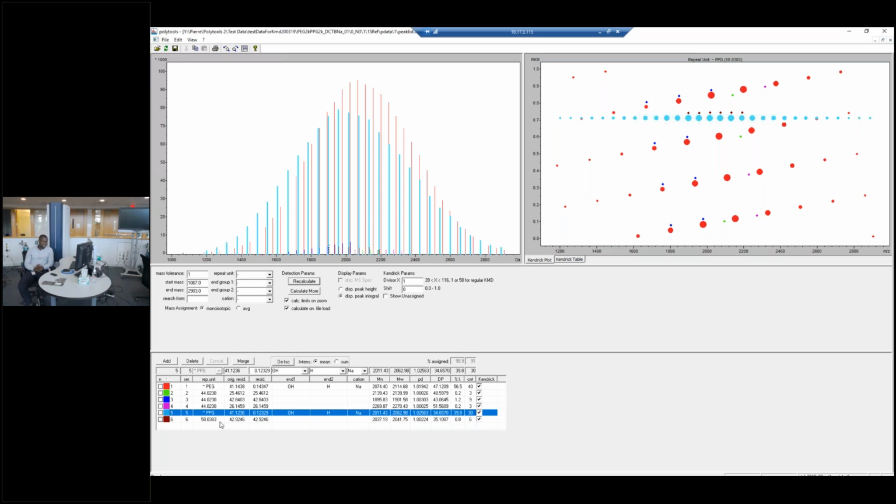So our target is ground steel targets. They're pretty robust, pretty hard and durable. Unless you're scratching it with a metal really, really hard, there shouldn't be any issues with the target.